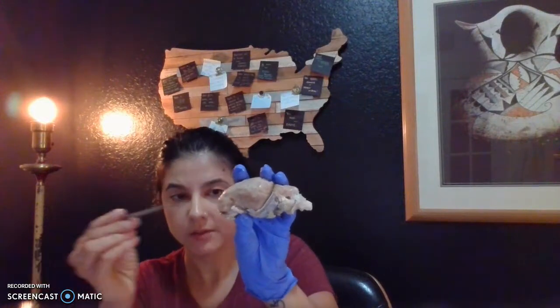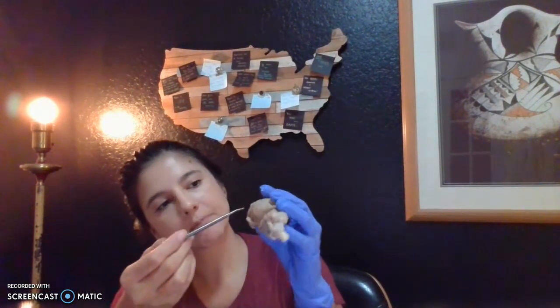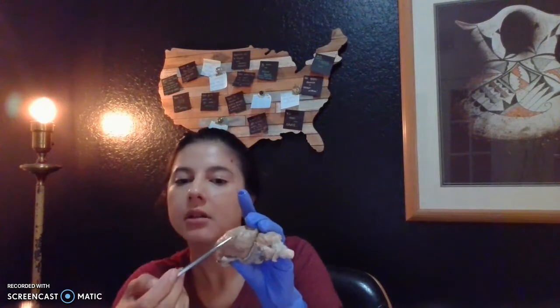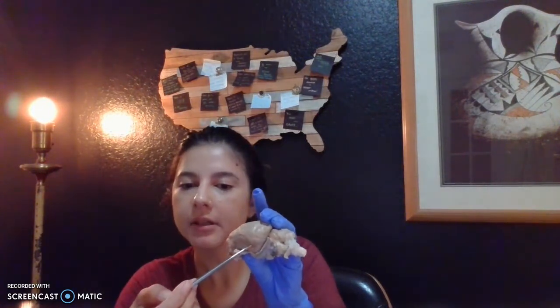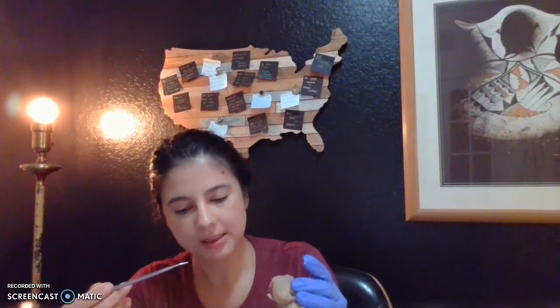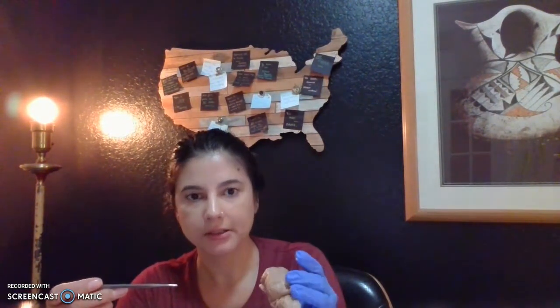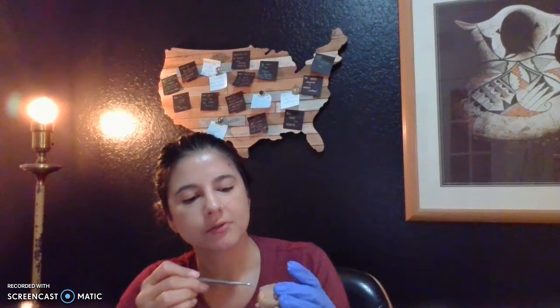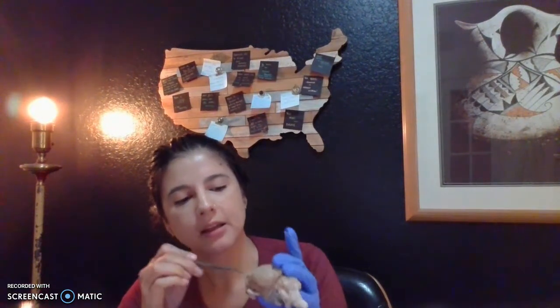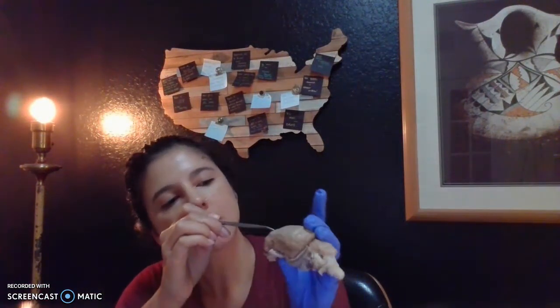So we have the frontal lobes here, the parietal lobes here, temporal lobes there, and then the gyrus or gyri, hopefully I'm pronouncing this correctly, are ridges on the brain, and you can see an example right there.